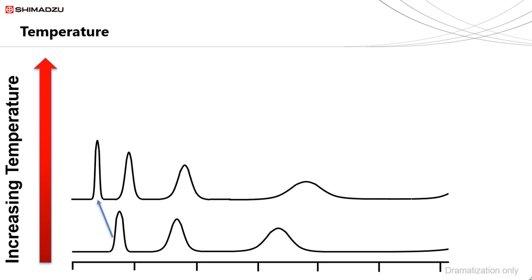This decrease also creates a narrower peak due to the same time difference. As the number of particles that creates the peak is the same, the area must match in both chromatograms. We have already said that the peaks are narrower, therefore, to have the same area, the peaks are also taller in our higher temperature chromatogram.